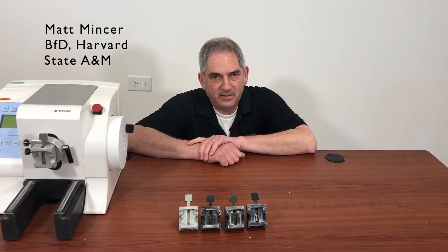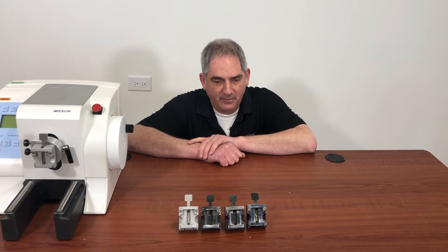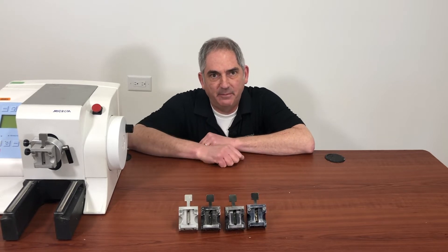Hey guys. Today I want to talk to you about the second most overworked employee in your lab, and that would be the Common Cassette Clamp.